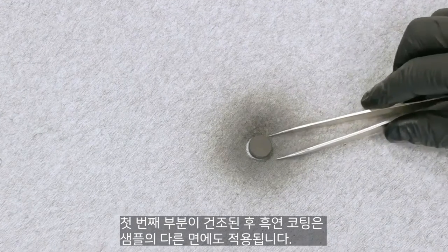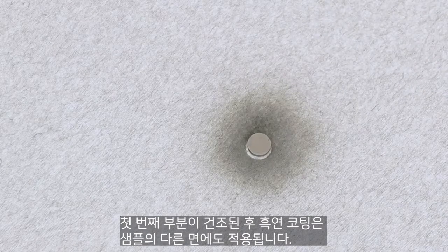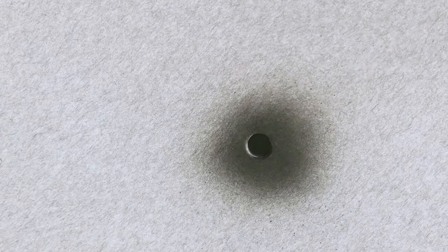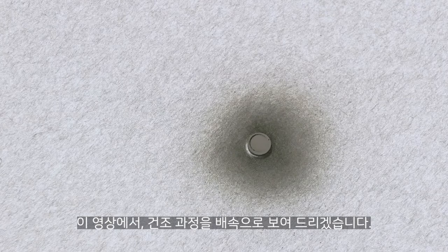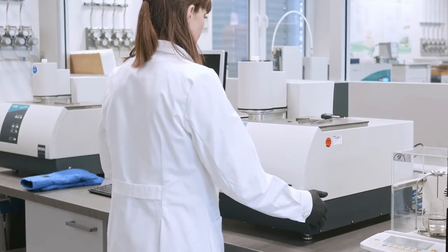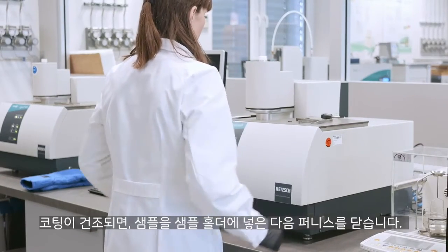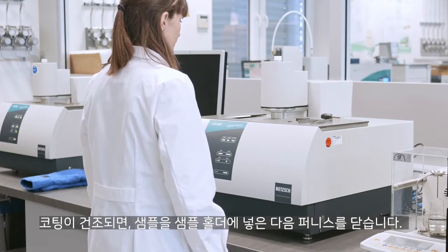After the first side is dried, the graphite coating is also applied to the other side of the sample. The drying process is shown accelerated in the video. Once the coating is dried, the sample can be installed in the sample holder and then in the furnace of the instrument.